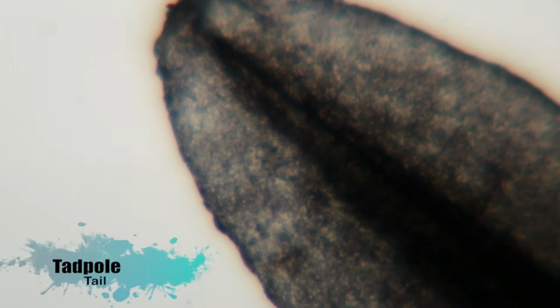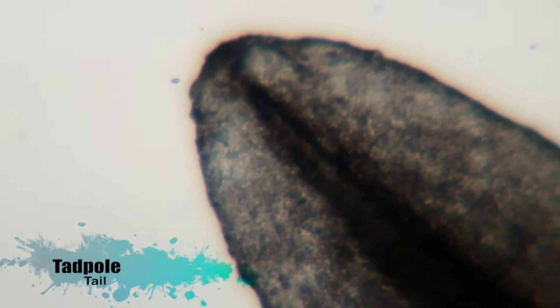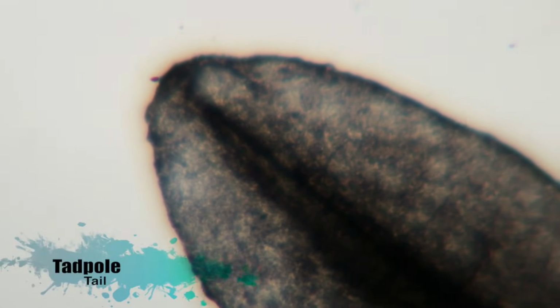And this is zoomed out a bit more using the 10 times objective, and this is zoomed out again using the 4 times objective. Now, if you haven't guessed what it is, it's actually the tail of the tadpole, and what you were looking at before was the actual blood cells moving through the vessels in the tail.